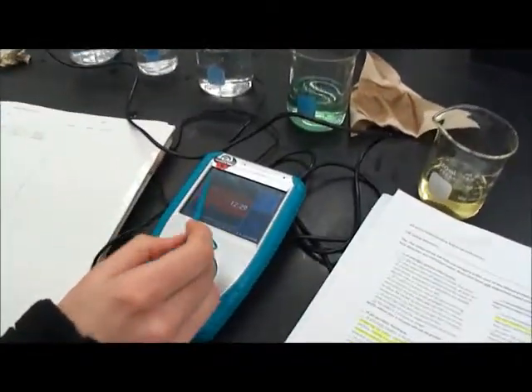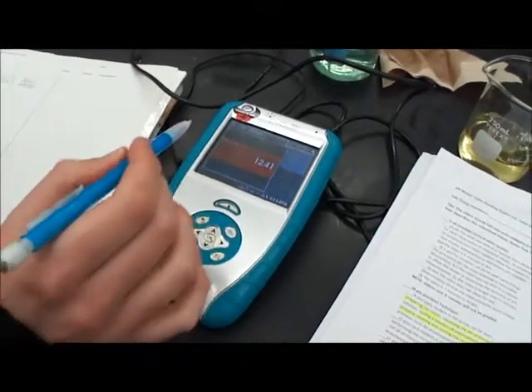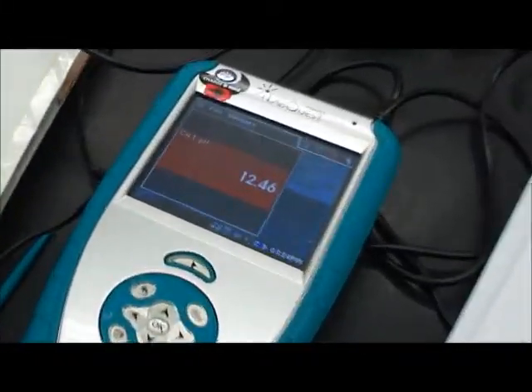Okay, so now we can see that the pH is above 7, which means it is a base. And we're going to say that the pH is 12.55.